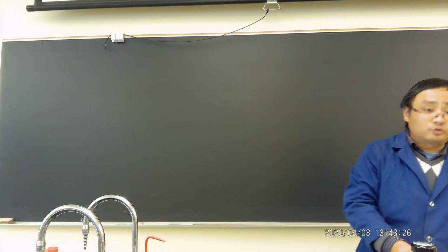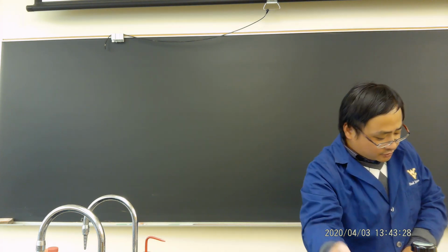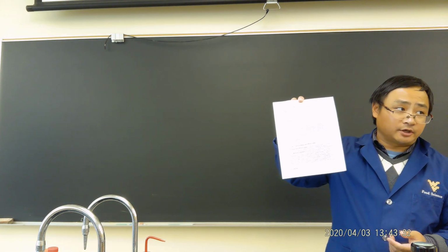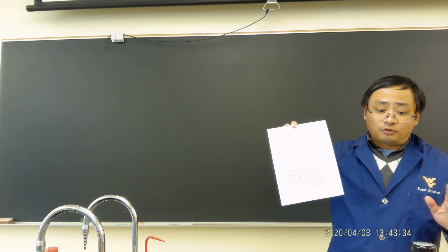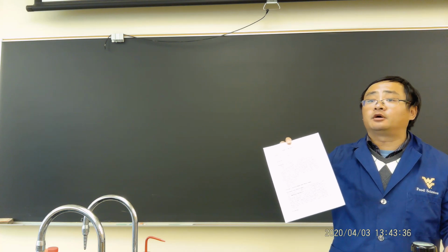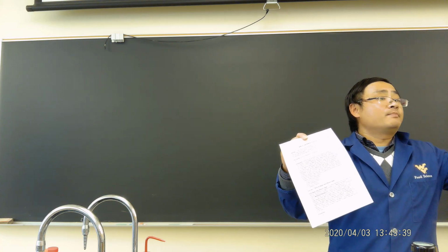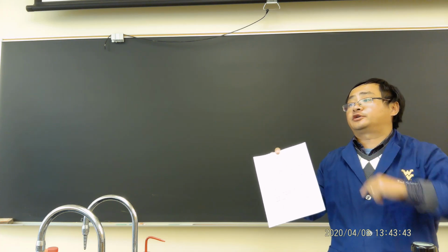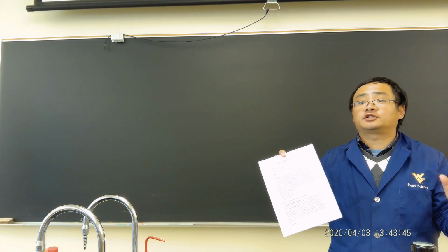Okay, so today we will do two lab works. The first one is the Kirby-Bauer test, which is an antibiotic resistance test. I will do a demo. I want one representative from each bench to do it, and the other students just share the results.